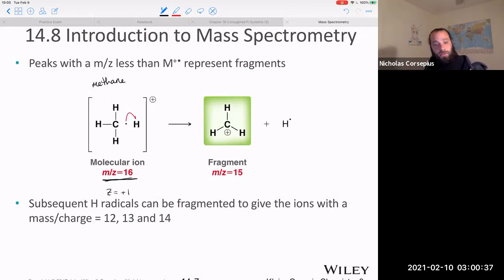And then we'd also see a fragmentation peak corresponding to the breaking of our radical cation into the hydrogen radical, which we won't see on the detector, and then this fragment. And notice, because we've lost this hydrogen to this fragmentation, our m/z has decreased by 1, because hydrogen weighs 1. If we lost more hydrogens, you would expect your mass to decrease by 1 for each hydrogen loss.